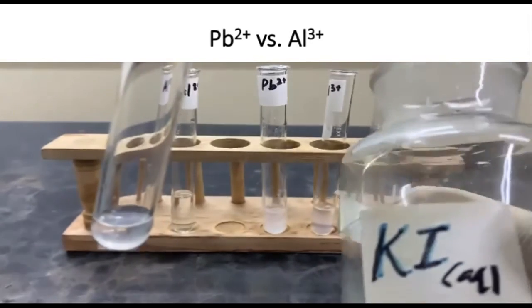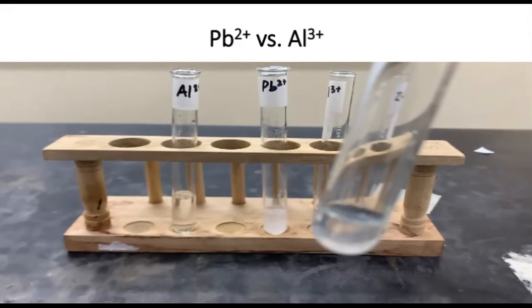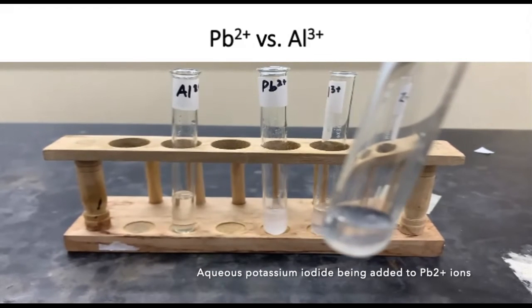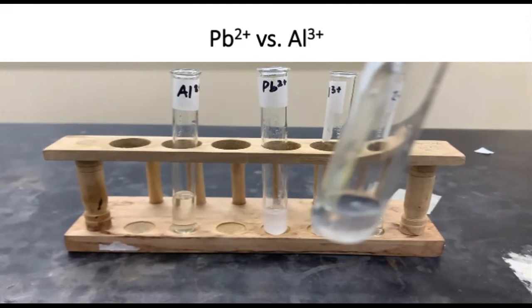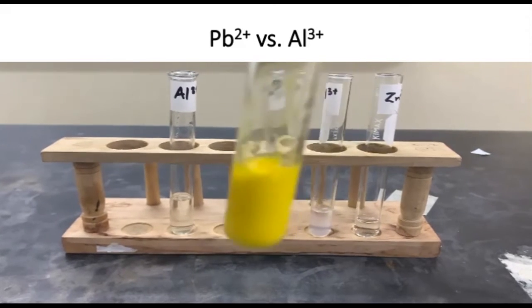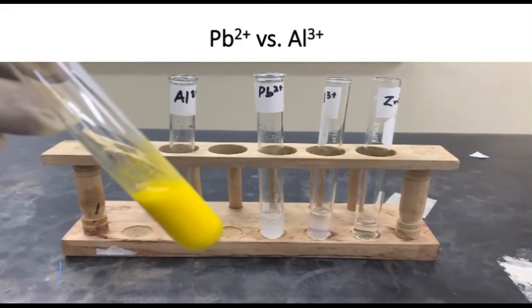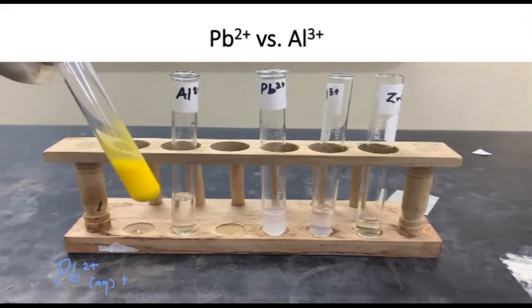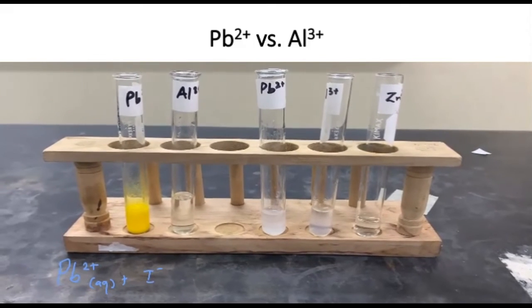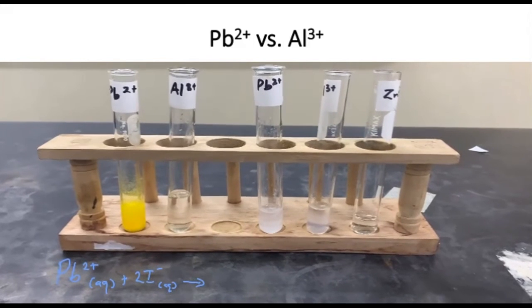We're going to add a small amount to our lead ions, and there we go. This is more than a small amount. We have what we call a bright yellow precipitate being formed. So there we have it. Confirmatory test. We've distinguished between our lead ions, our Pb2+ ions, and our Al3+ ions.